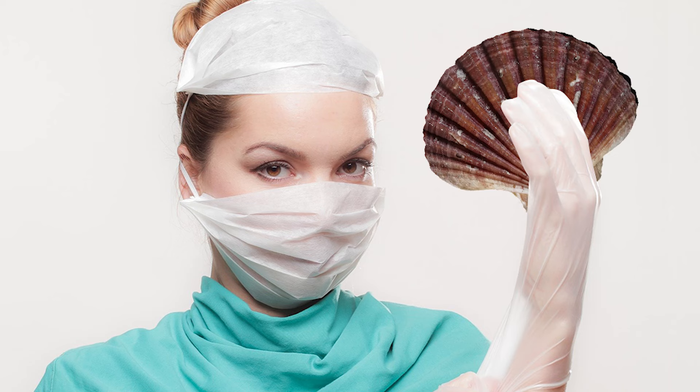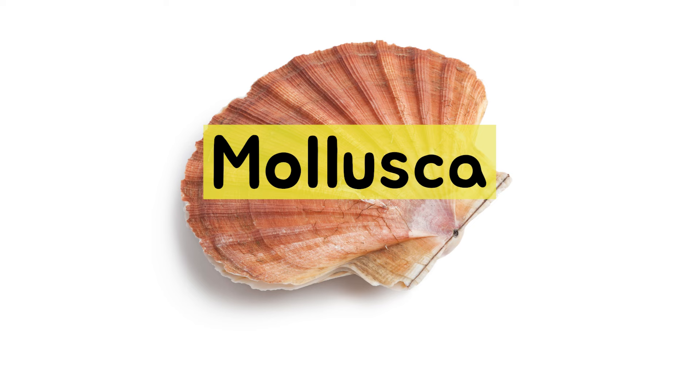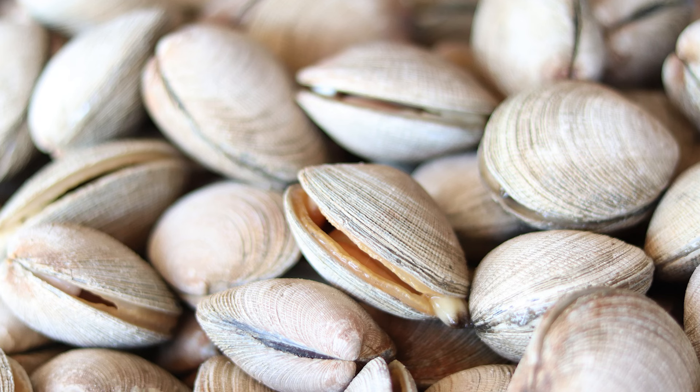Today, let's do scallops anatomy. First of all, scallops are mollusca, such as snails, squid, octopus, conch, clams, etc.